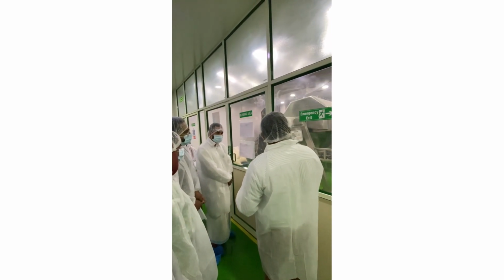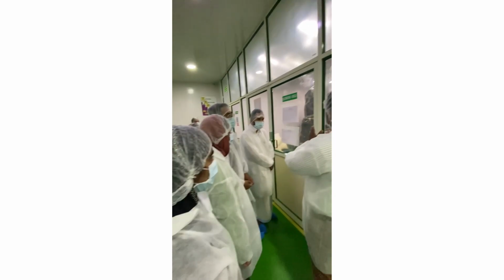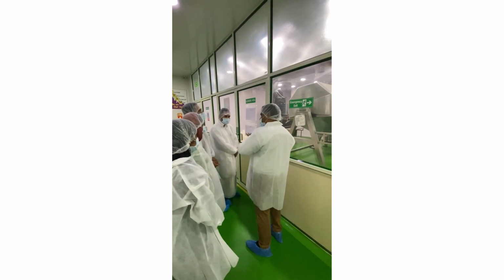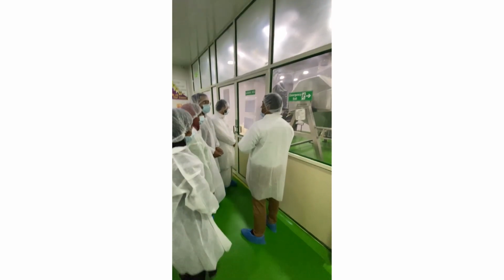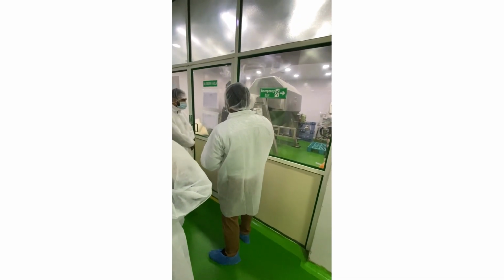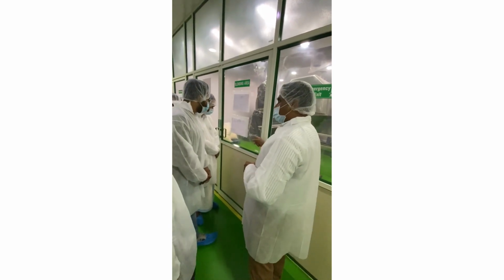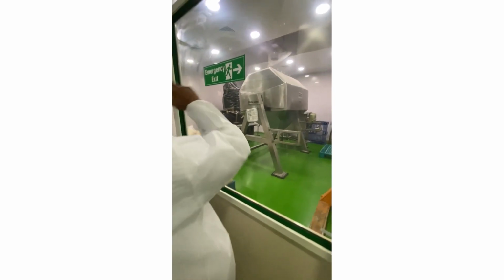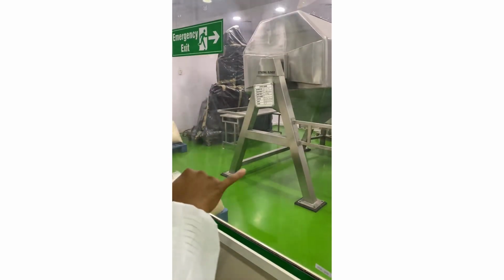So we will bring it here, mix it and blend it. We have a standard operating procedure for every product. That is the only one we follow. We will ensure that no deviations happen. After blending, we will unload it into a polythene cover, which will be taken to the packing machines. We have a packing machine for coffee creamer and a separate one for coffee black. So it will be brought here.